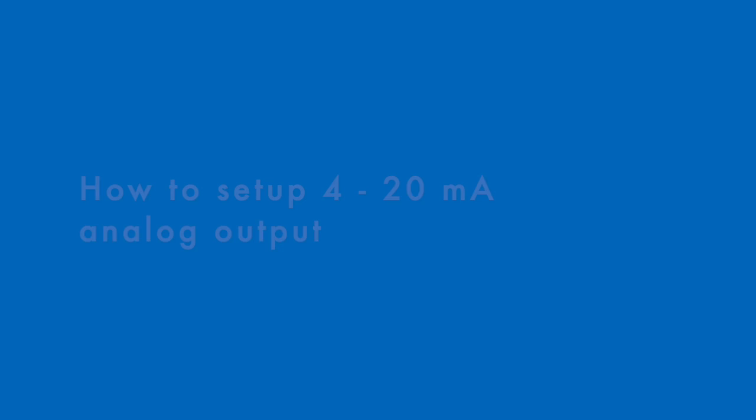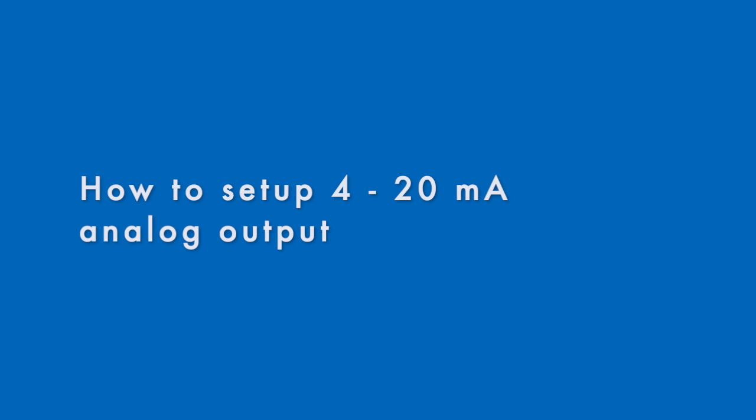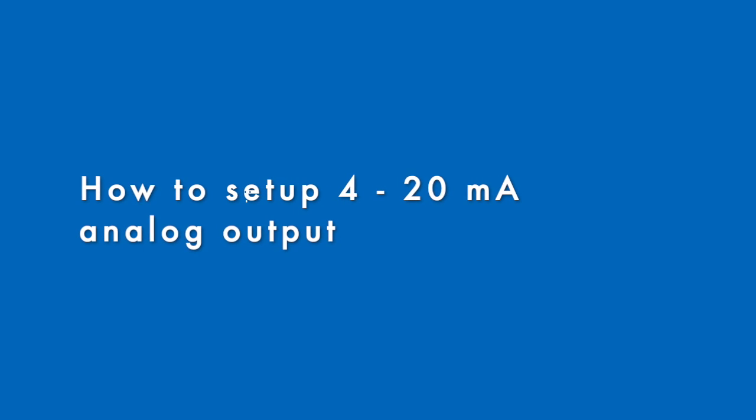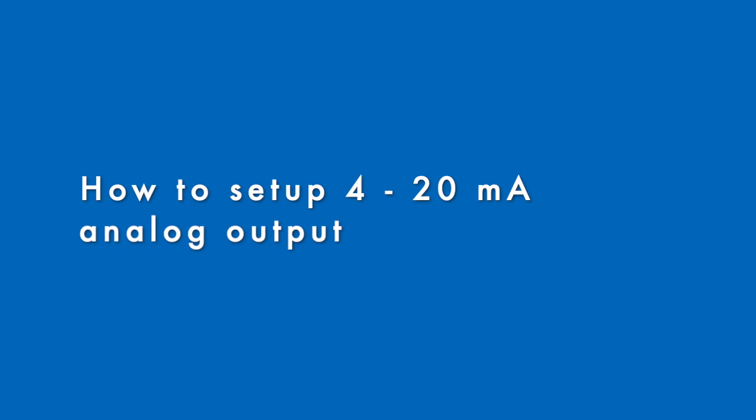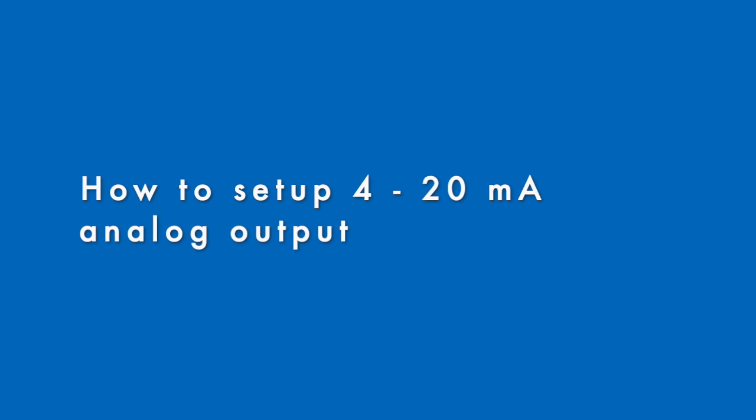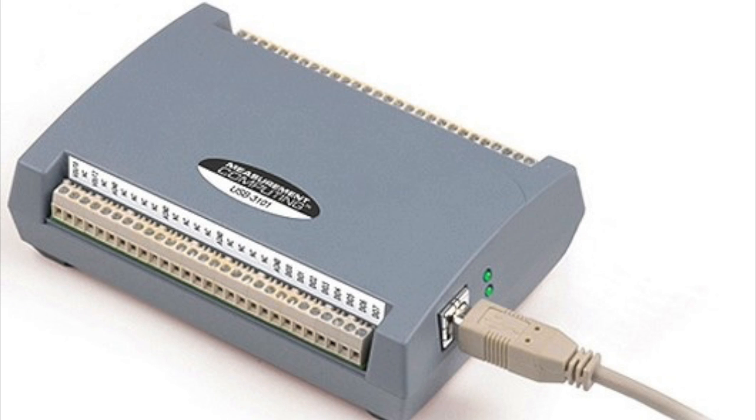Hi there, for setting up the analog output on your NCLD analyzer you will need the USB 3102 box. Connect the USB 3102 box to one of the USB ports in the back of the analyzer.